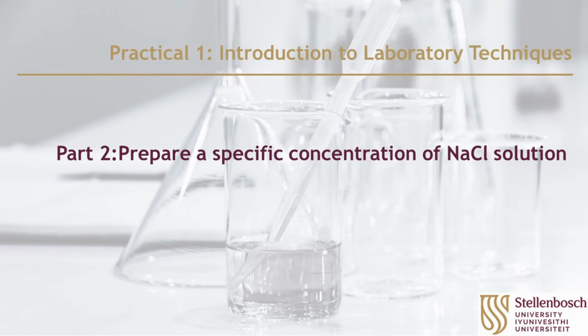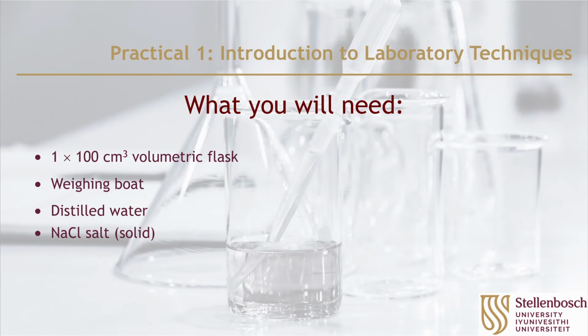In the second part of the practical, you will need to prepare a certain concentration of sodium chloride solution by making use of a volumetric flask. From this known concentration, you will then be able to calculate the density from the measured mass so that you can compare it to the expected density according to the calibration curve. What you will need for part 2 of the prac is one 100 cubic centimeter volumetric flask, one weighing boat, distilled water, and the sodium chloride salt.